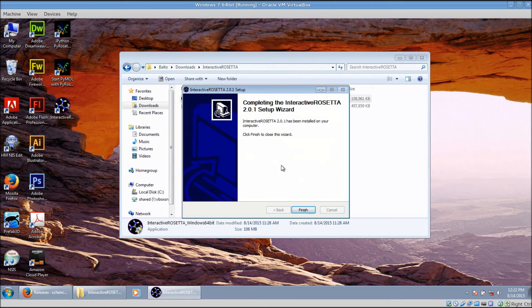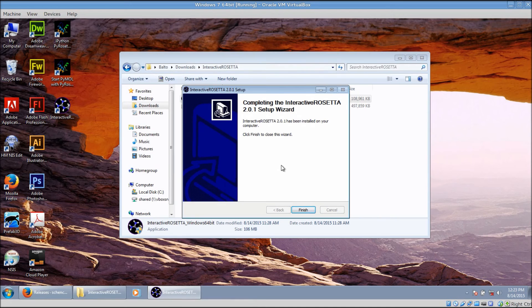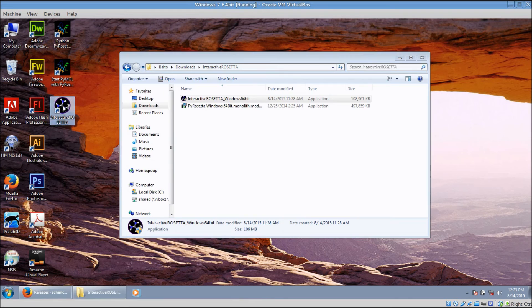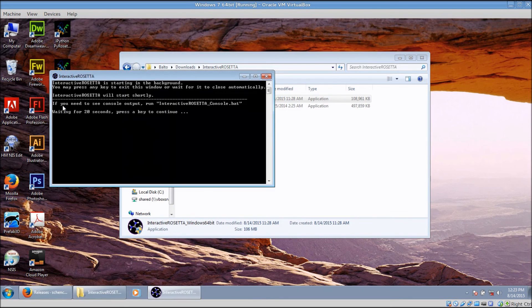Once it is done, you should have shortcuts to Interactive Rosetta on your desktop and in your Start menu. If I double-click on the icon, it will start the program.